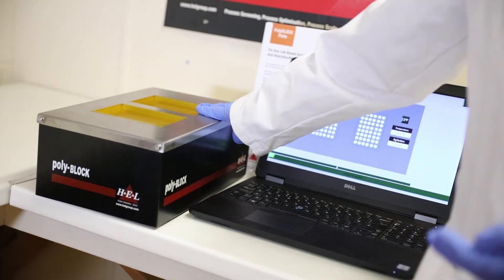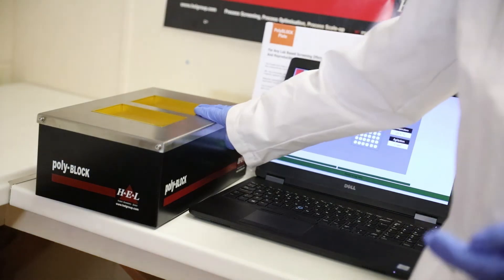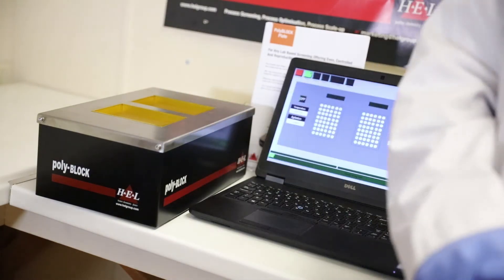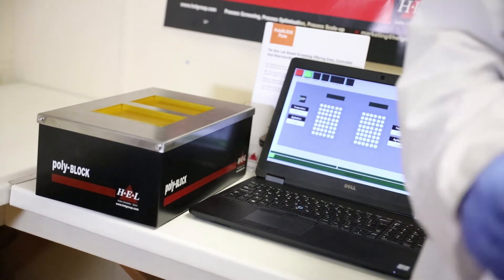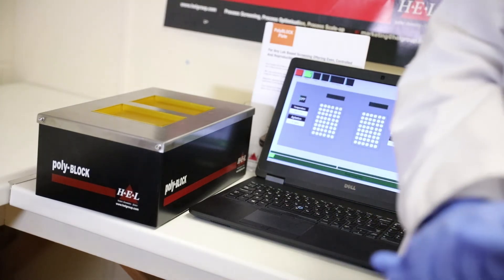Each zone has a different stir speed that you can set and a different temperature you can set. Maximum temperature is up to 190 degrees C, although we often cap that in the software because people are using plastic plates and you don't want to melt them.